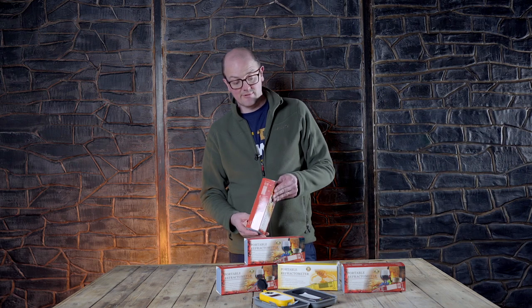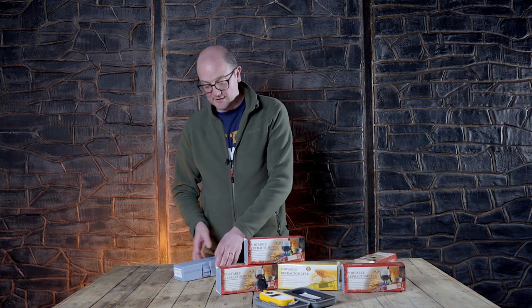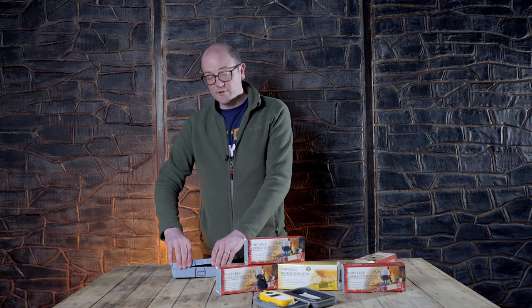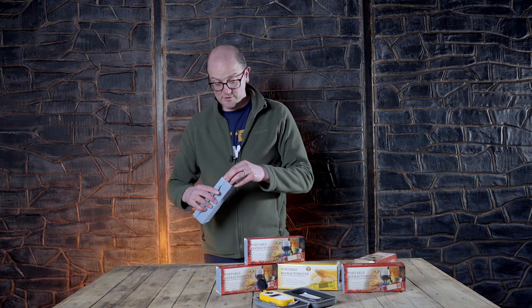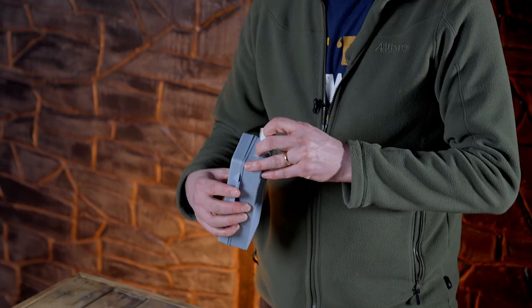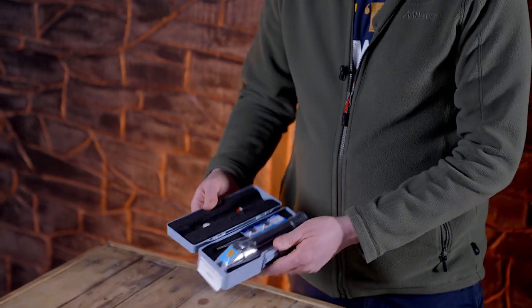We have refractometers — basic ones — where they measure ordinary gravity or whether they measure Plato, which is commonly used in European brewing as opposed to the UK or Irish version of doing it.